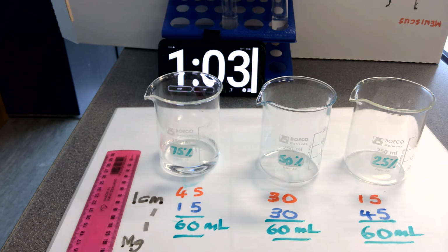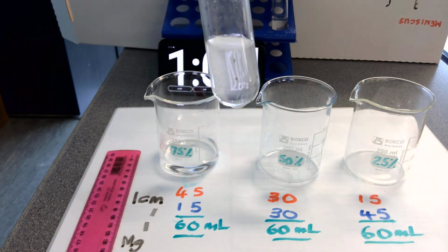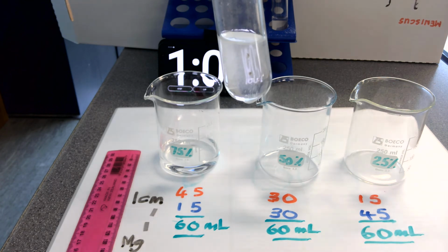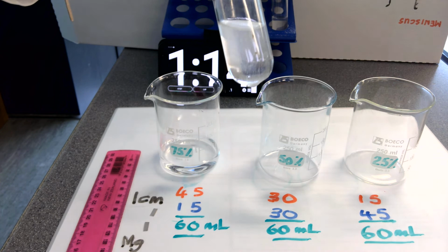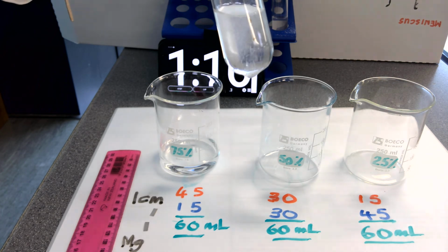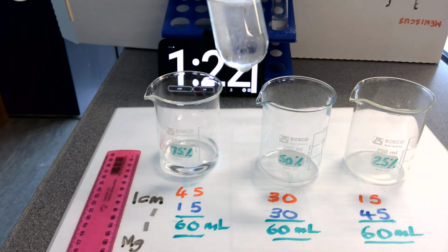And now you can see that all 3 reactions are proceeding, and the end of the reaction is when there is no more production of hydrogen gas, because you won't see any more bubbles, which means that the magnesium has completely reacted with the 75% concentration of acid.